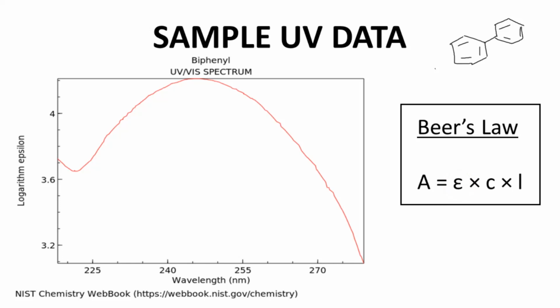Note that a UV spectrum would record absorbance versus wavelength, lambda. From absorbance versus wavelength, if you know the concentration and path length, one could construct the graph shown, log of epsilon versus wavelength. Those are the basics. We do not need to understand the math to use UV-VIS in organic chemistry, but it's always good to know some of the theory.